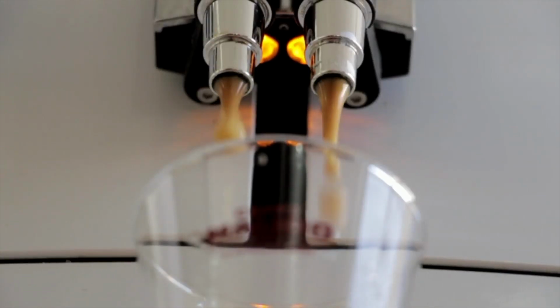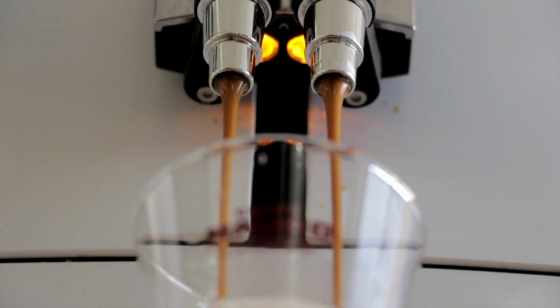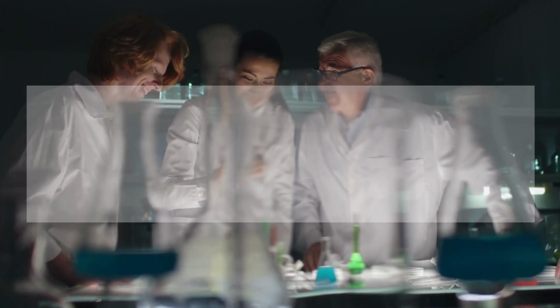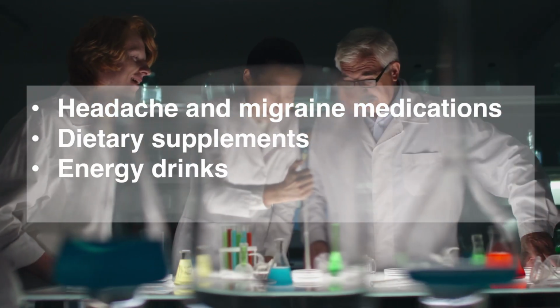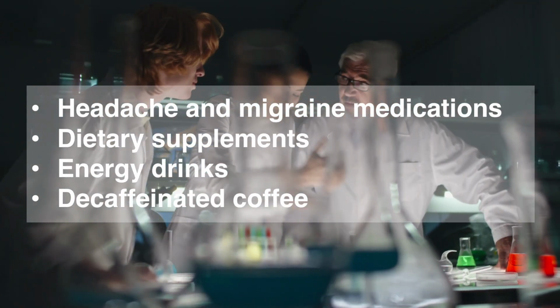In this experiment, I explored different ways to extract caffeine from coffee grounds. I wanted to see which method results in the highest concentration. After extraction, caffeine can be used for headache and migraine medications, dietary supplements, and energy drinks. This process is also used to make decaffeinated coffee.